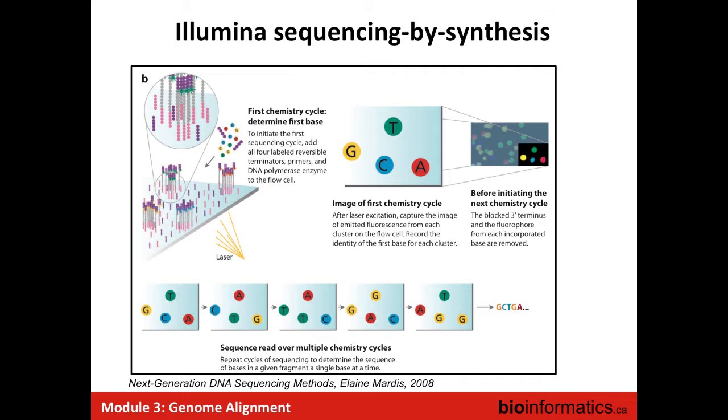If you take this cluster, you can imagine this cluster will be a mix of molecules that are pink down and purple up. And there will be a mix of other molecules which will be purple down and pink up. Okay. So when the probe is on the flow cell, you cannot use it for sequencing. The sequencing will always start from the top. So you can imagine you have the cluster, a group of forward and a group of reverse.